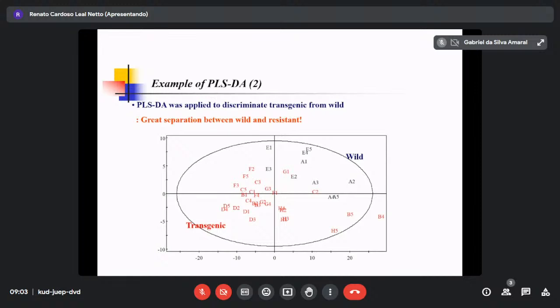Some people do it this way: from my principal component analysis data, accession A and accession B are two major, two different groups. Then I will do PCA separately for accession A and accession B. That is also possible. But for me, first I want to include everything for PLS modeling and suppress the accession.